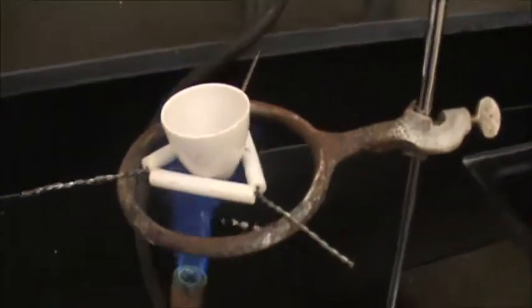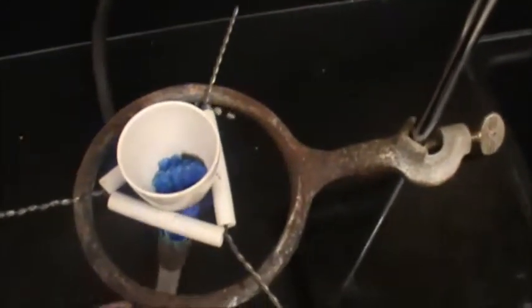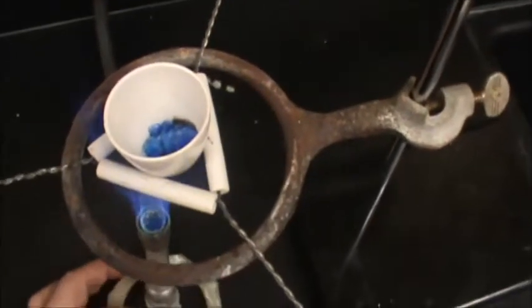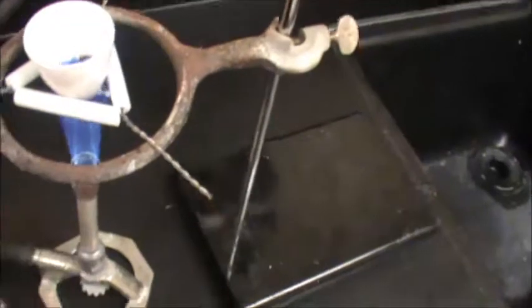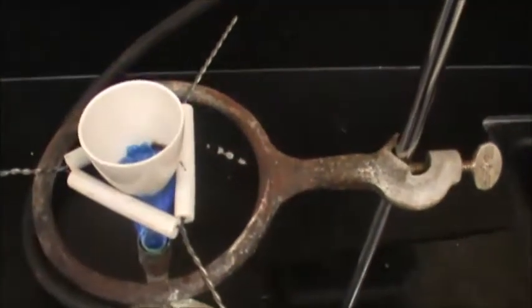Yep, I'm still heating. If you want to make an observation, I can't get too close with this flame. I can hear it sizzling just a tad, from the moisture that's in the salt itself. So I'm going to let that flame sit there for 2 minutes, and we're going to let it cook. And I'll come back.